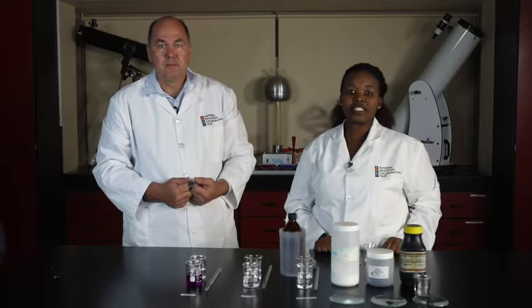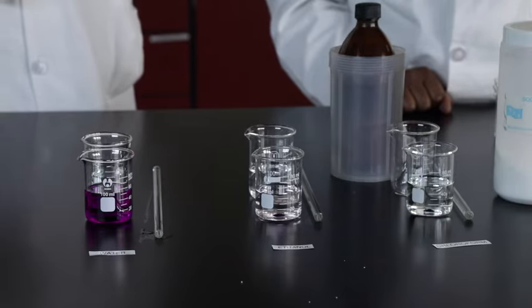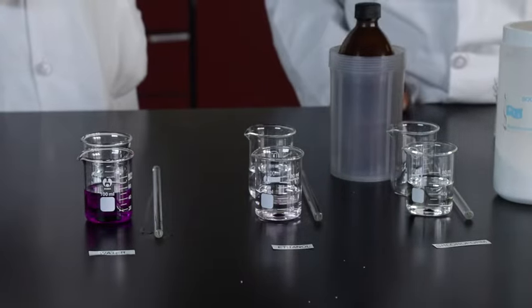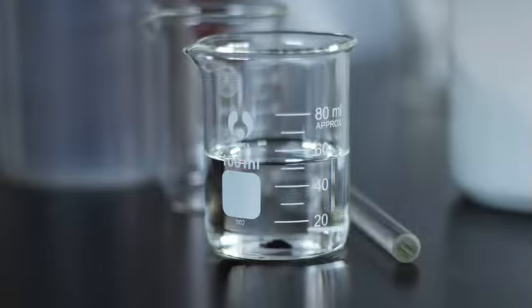The crystals of potassium permanganate are dark purple, almost black in color. We should be able to see them quite clearly in this colorless solution. Now let's have a look at what happens in the water. It's a very pretty color. And what about in the ethanol? Make sure you write down your results.